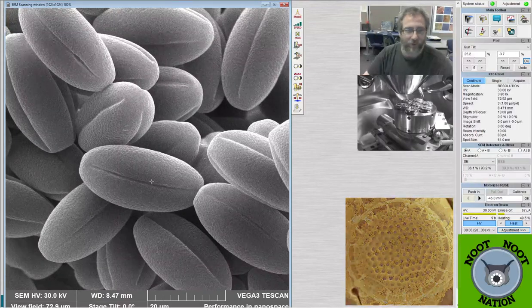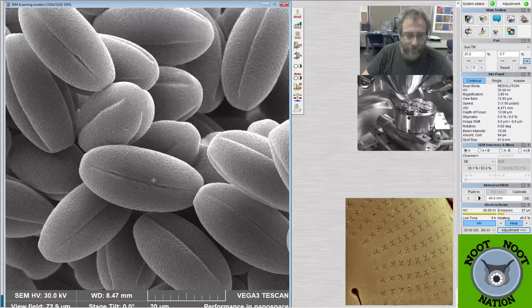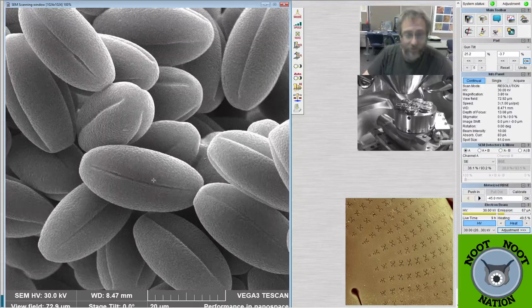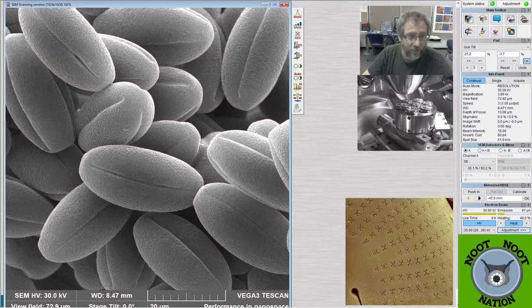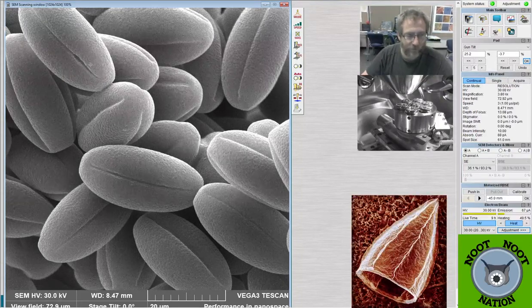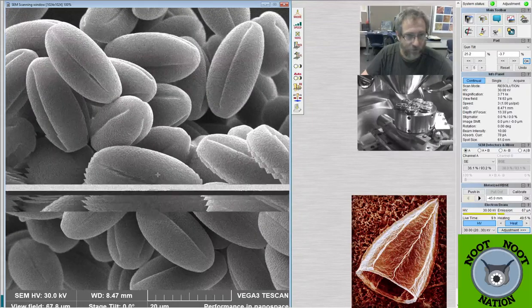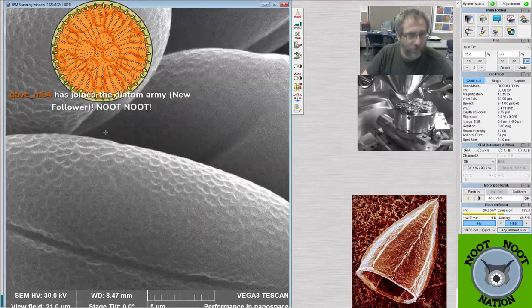You just take a picture of anything, any organism, spiders if you like, and it will try to tell you what it thinks it likely is. It gives you a list of 10 different options and pictures to leaf through to see if it matches what you think it is. So with the SEM, we can just zoom in like crazy.